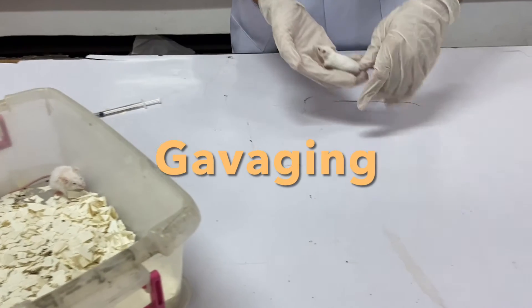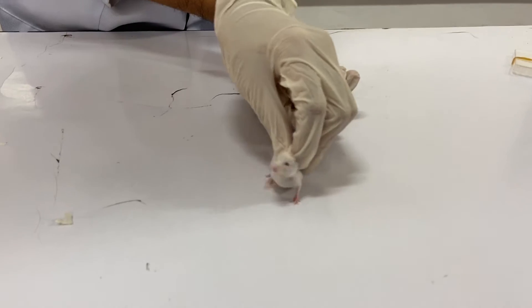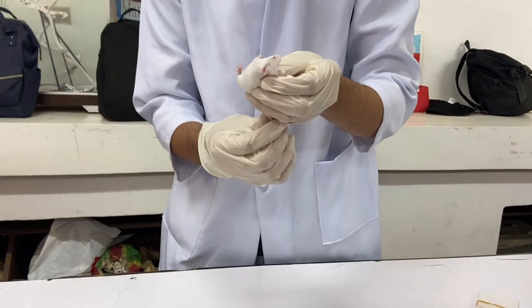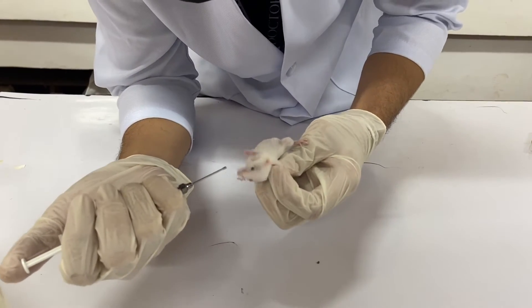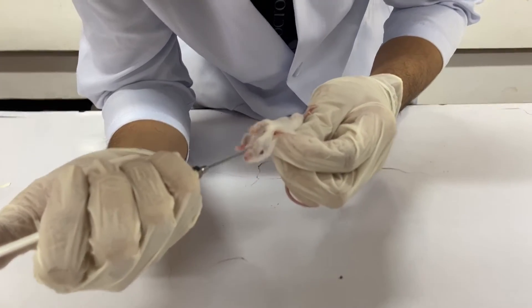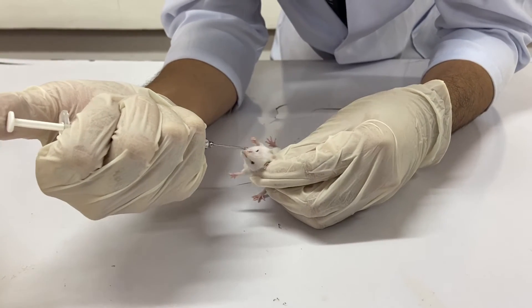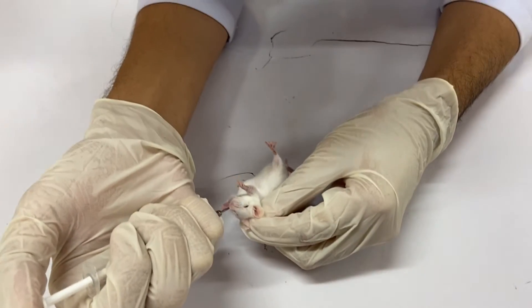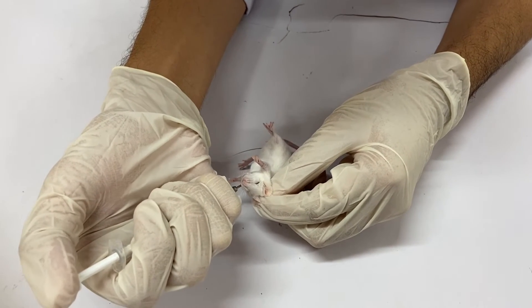Restrain the mouse using the one-hand scruff technique by the neck with the head and body at a 90-degree angle for ease in inserting the gavage needle. Insert the straight gavage needle appropriate for the size of your specimen in the space between the left incisors and molars, and gently direct it caudally toward the right ramus of the mandible. The mouse swallows as the gavage needle comes close to the oropharynx to facilitate entry into the esophagus.